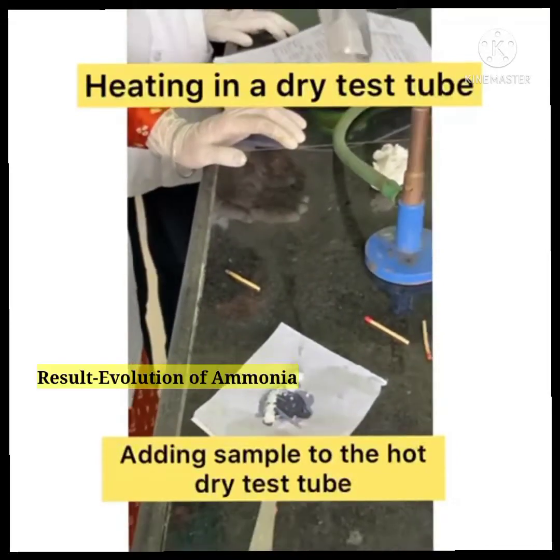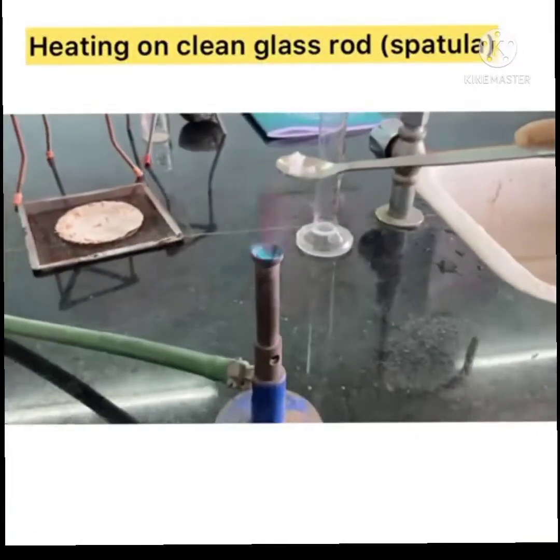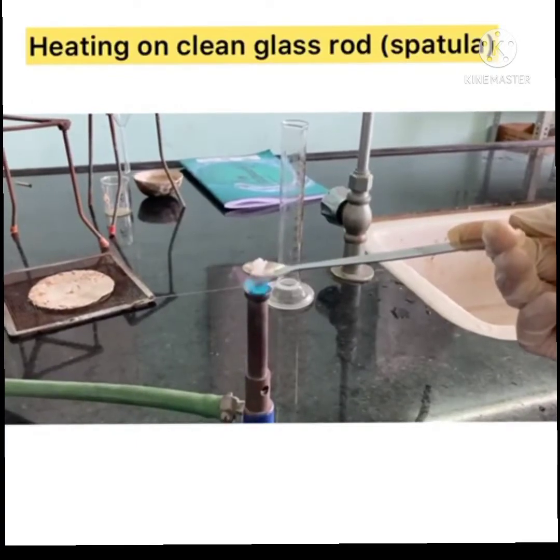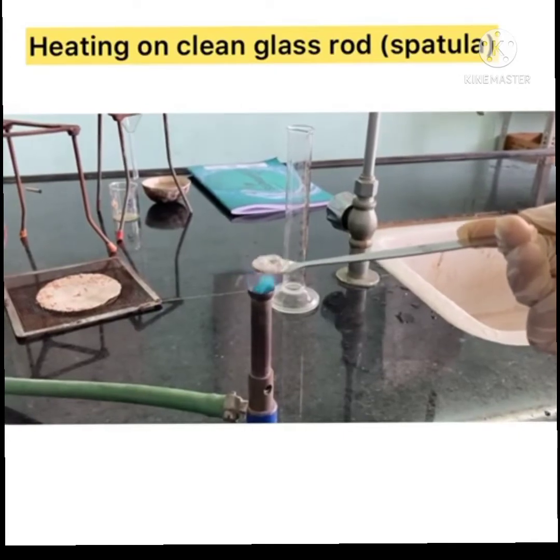Then heating on a clean glass rod: in this test, we use a spatula instead of a glass rod. A non-sooty flame is observed, which means an aliphatic compound is present.